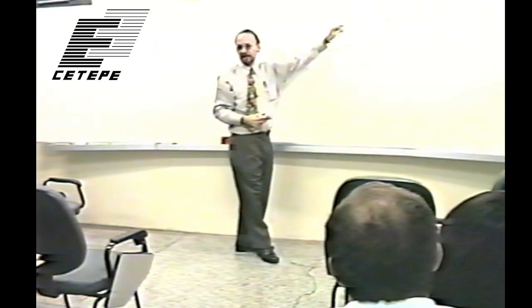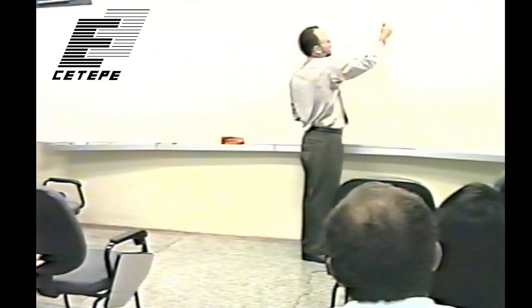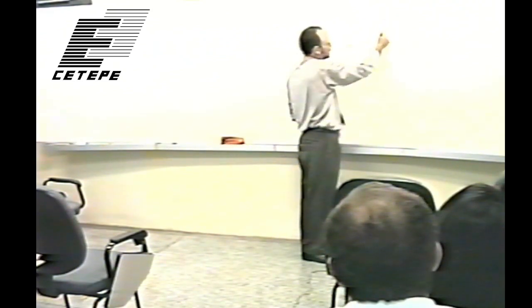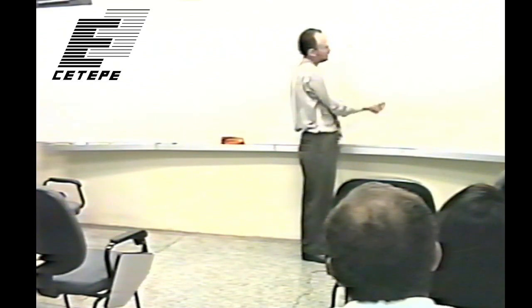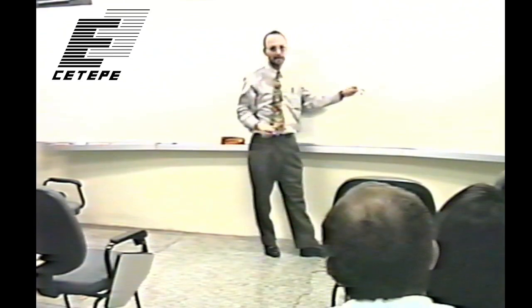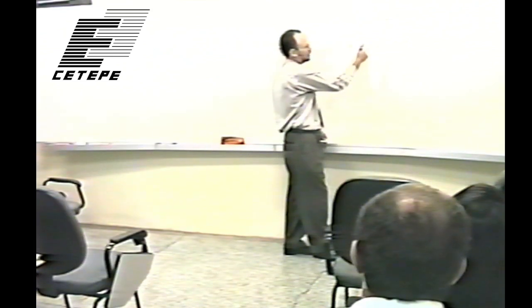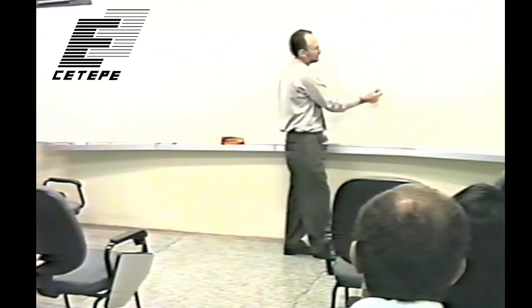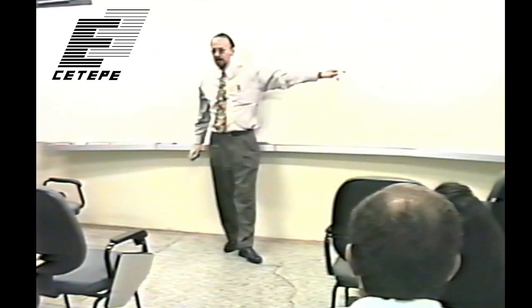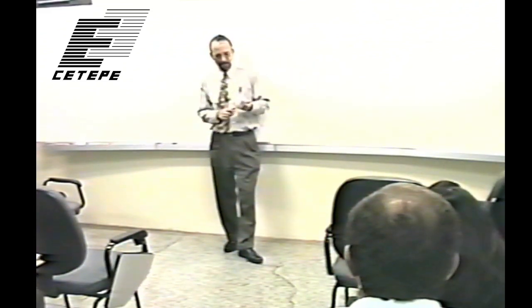So if you, for instance, had the image of an infinitesimal point object that was contributing here at this location in the screen, and if I draw the image upside down here, you would hope your image would just be a delta function at that location. But because of the spreading of light, what your image in fact looks like is going to be some kind of a Gaussian thing like this, which in a minute we'll start calling the point spread function.